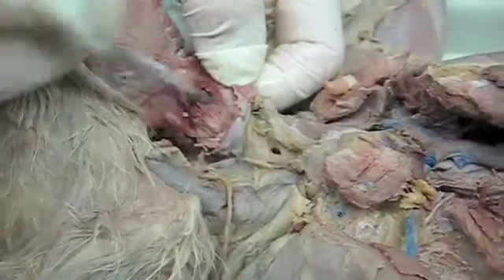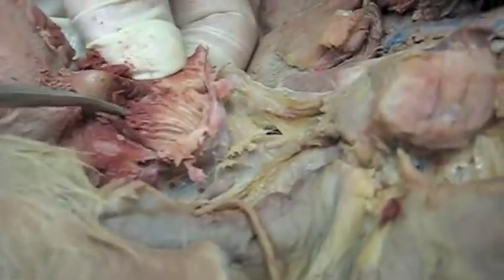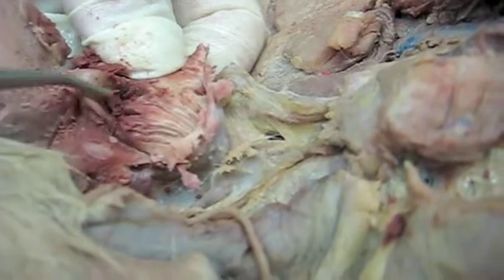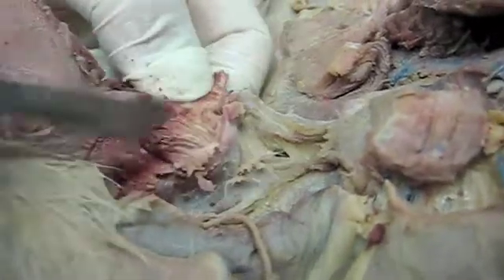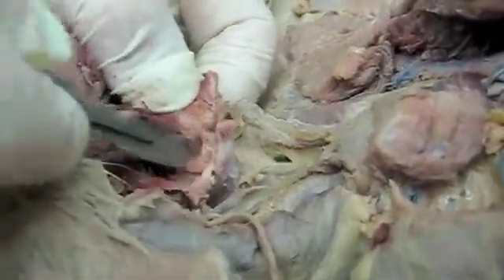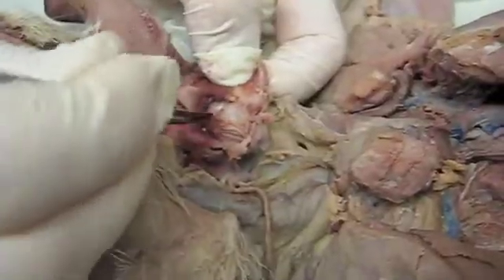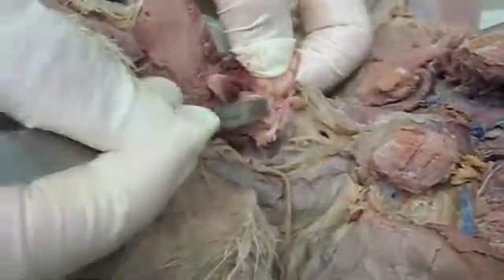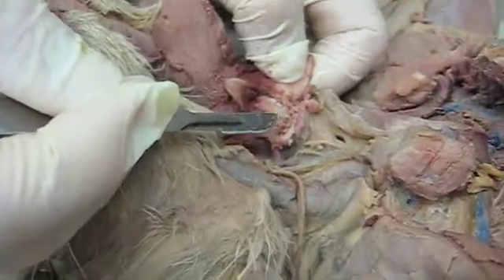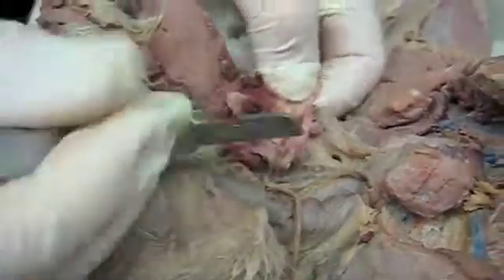actually just cutting away some of the esophagus there, but anyway. So your epiglottis is there, right? And then this slit right here, that's the glottis. Okay. That's where we're going down into the larynx. And we're going to cut through that in just a minute, but let's see if I can. These muscles really adhere to these areas. So the arytenoid cartilages are dorsal, and the other ones are ventral. Well, the cricoid is both ventral and dorsal. The thyroid is just ventral, and then the arytenoid is just dorsal.